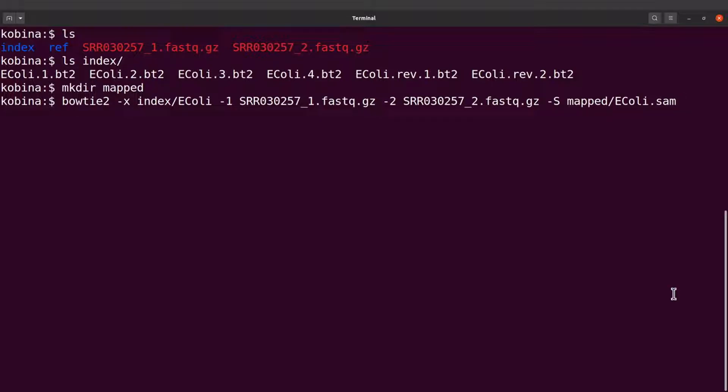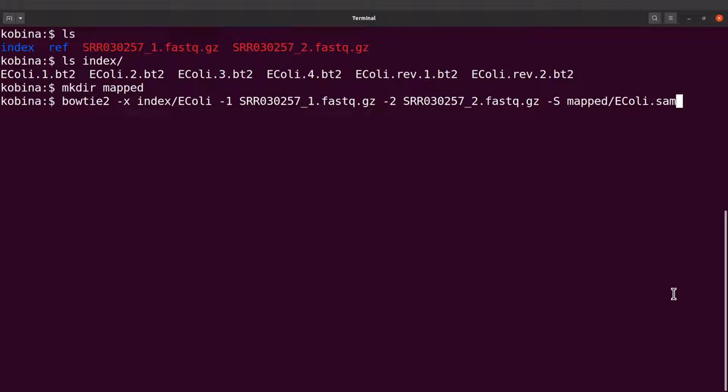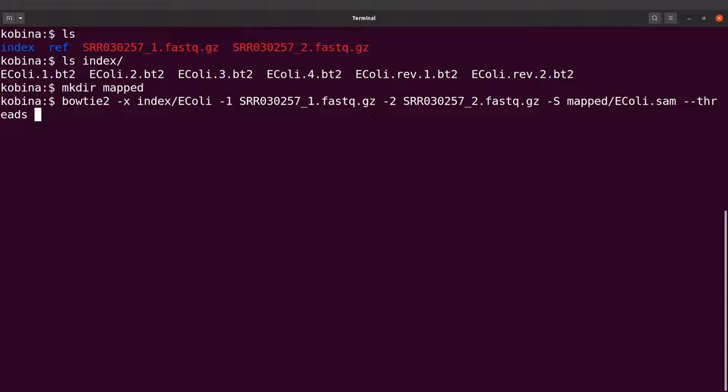You can speed up Bowtie 2 by specifying threads. If you have a PC with a lot of CPUs, you can use the --threads flag. Here I will use eight threads. If you have more, you can increase this number.